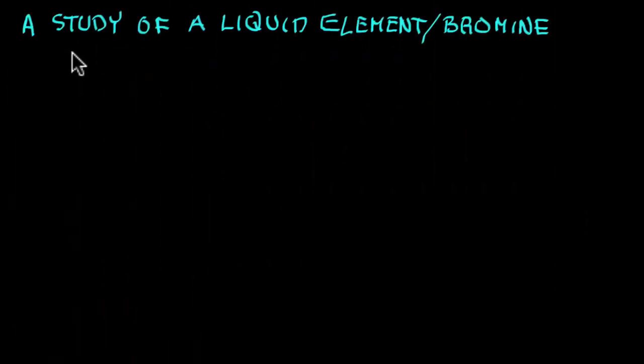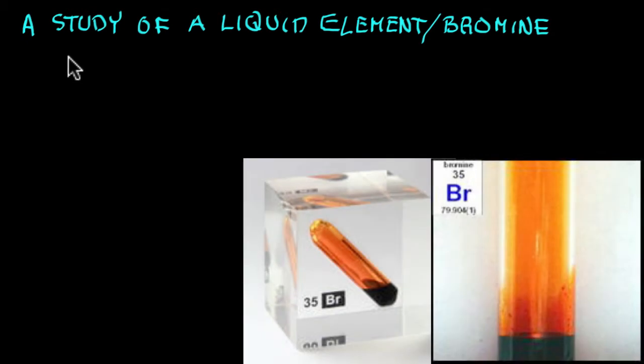Session is on the study of a liquid element, bromine. If you viewed two of the previous tapes on elements, we had two on a solid element, copper. So let's start. Here's how we start learning about an element. I hope you know by now it starts with observation.